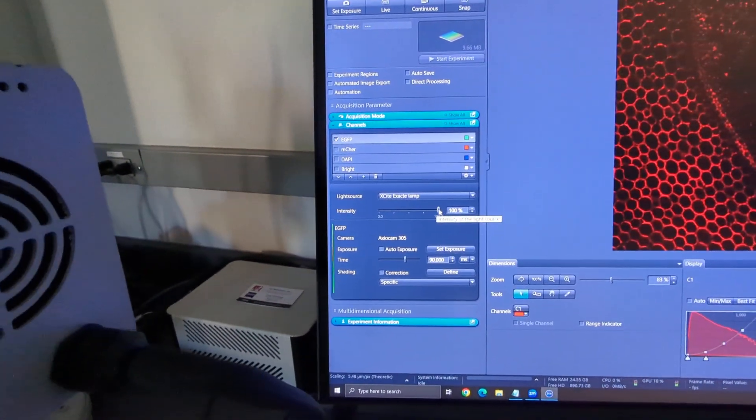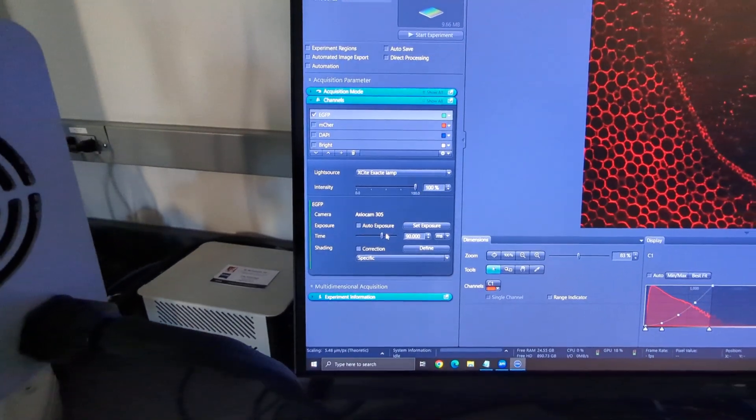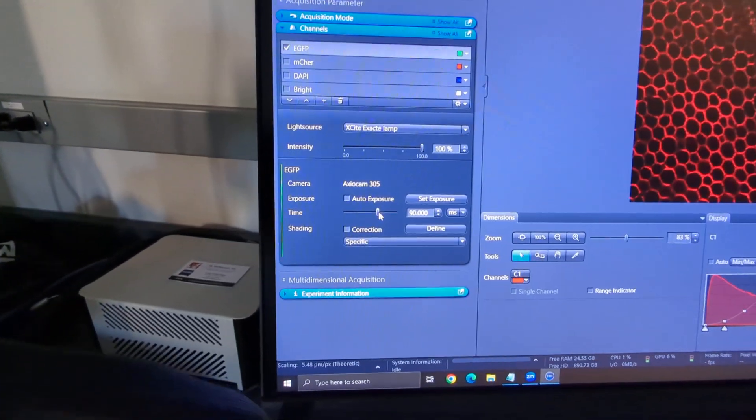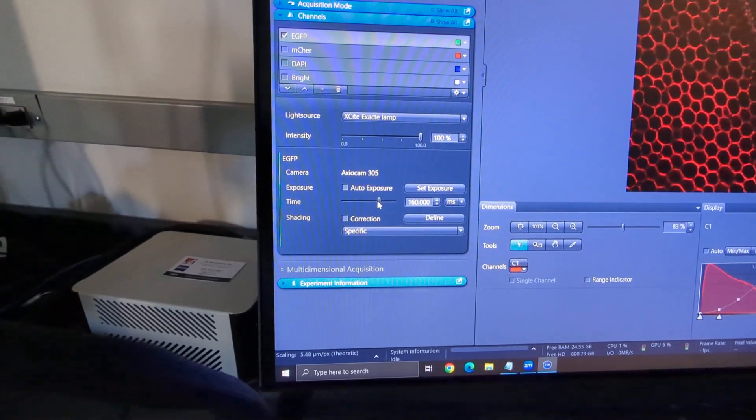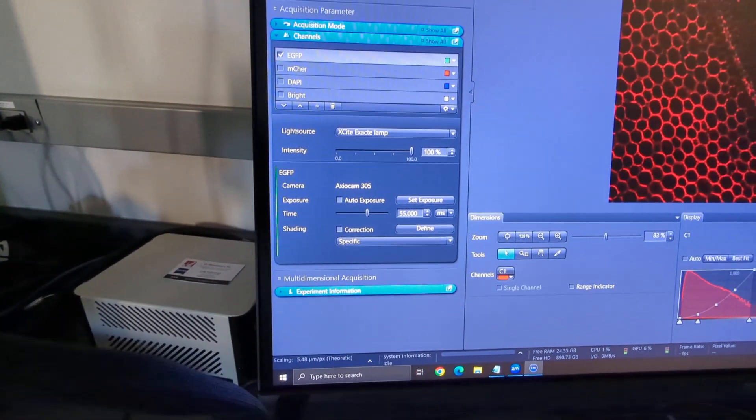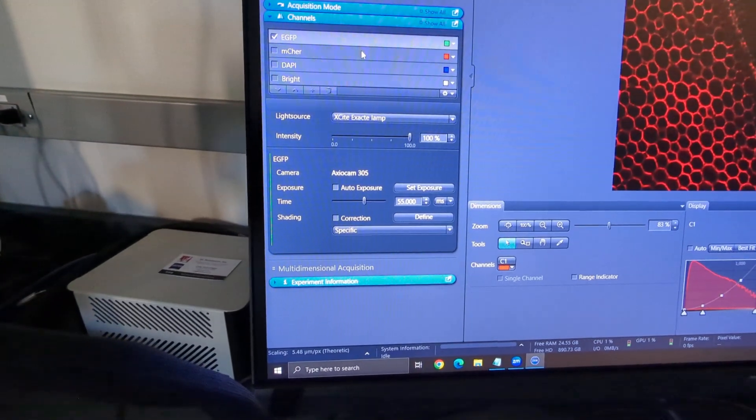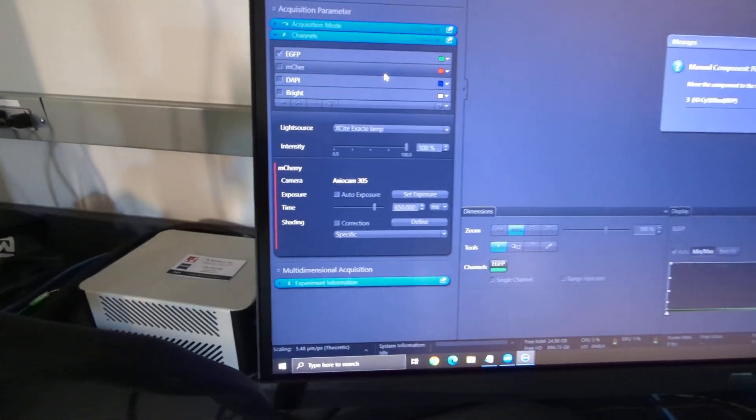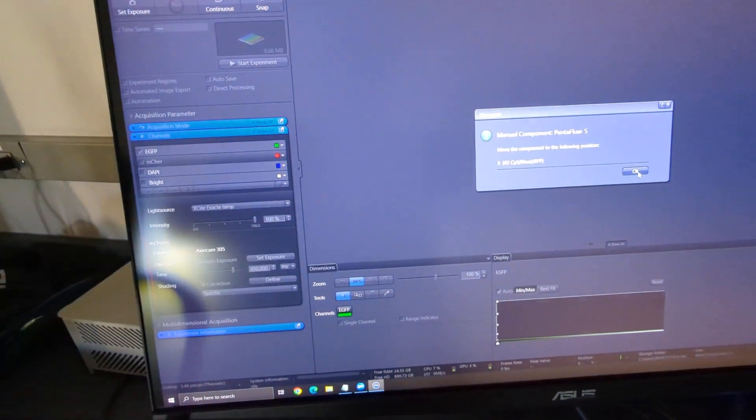Same thing as before, keep it at 100, don't really need to change that much, but go ahead and adjust your exposure time here. Let's go to live and I'm going to say m cherry, and it gives you a pop-up warning anytime you change.